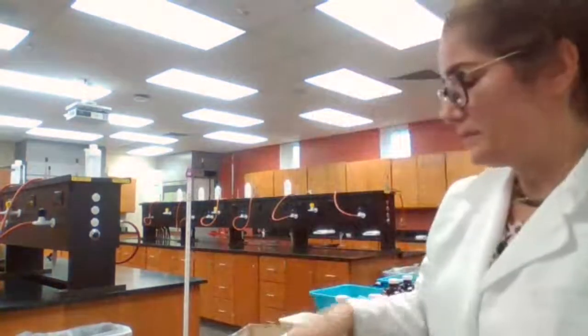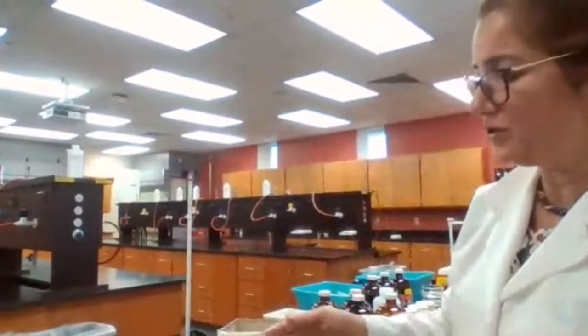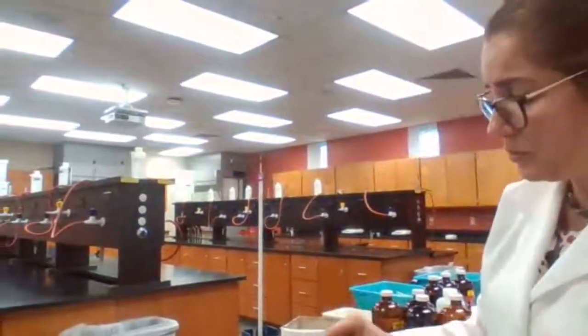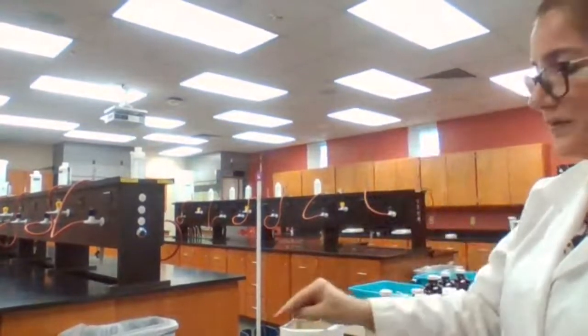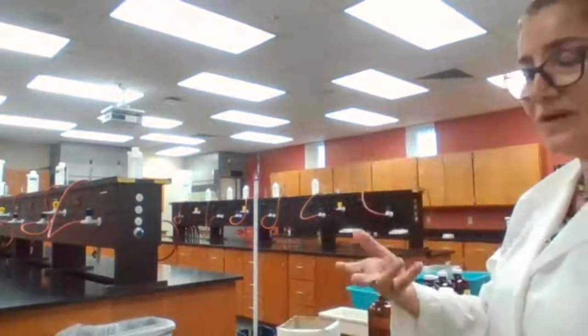Just keep in mind, if you're doing this experiment and your sample is melted, you missed recording the exact number when it was melting. You take the sample, it's liquid when it's inside, and when you take it out, it's solid. When it's hot, you take it out, it's solidified again.